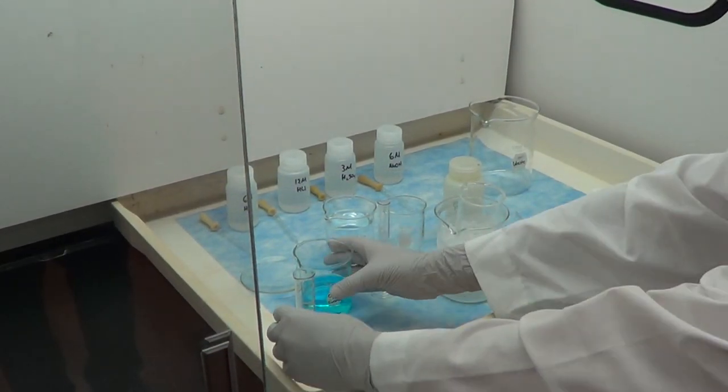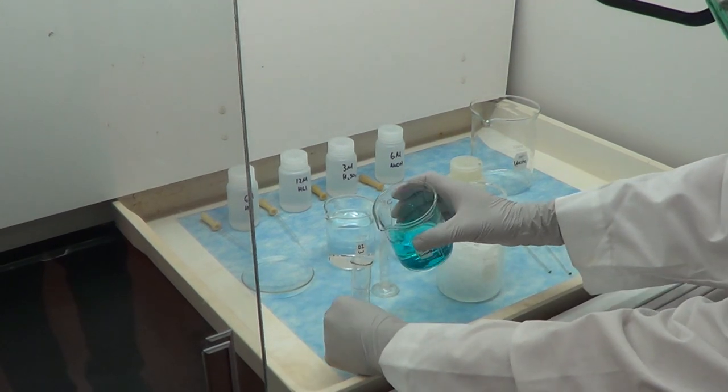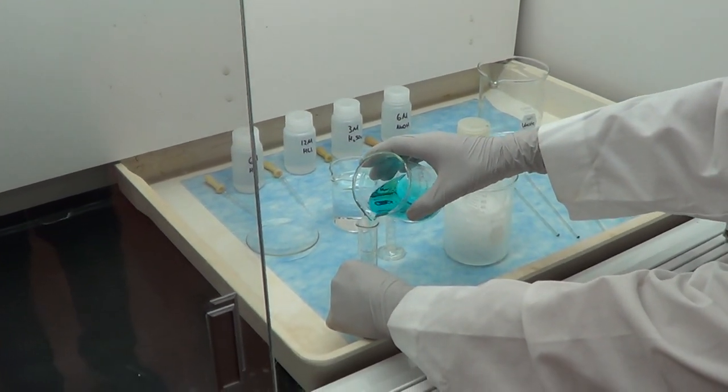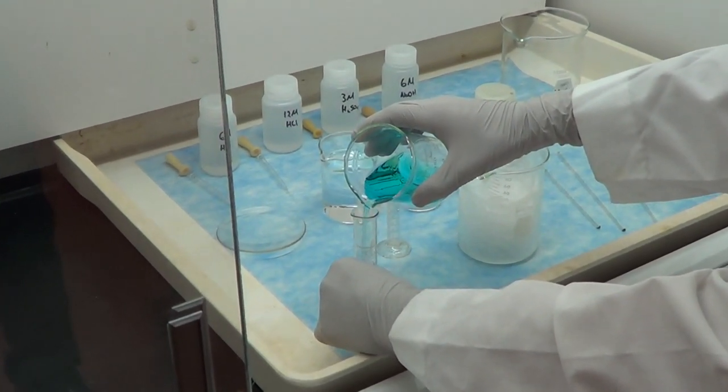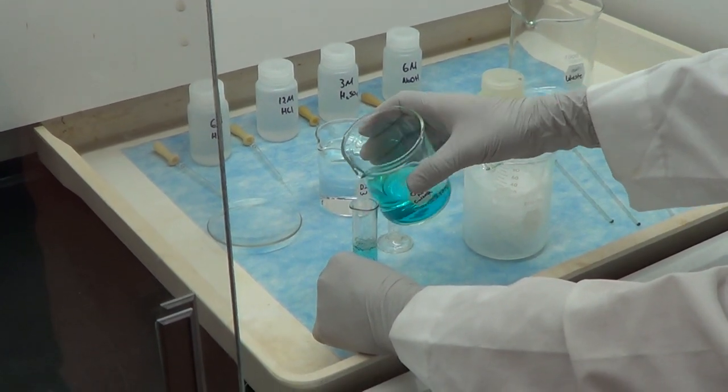Now we will carefully measure 10 ml of copper nitrate solution using the measuring cylinder and transfer it to the beaker whose weight was recorded before and placed on an ice bath.